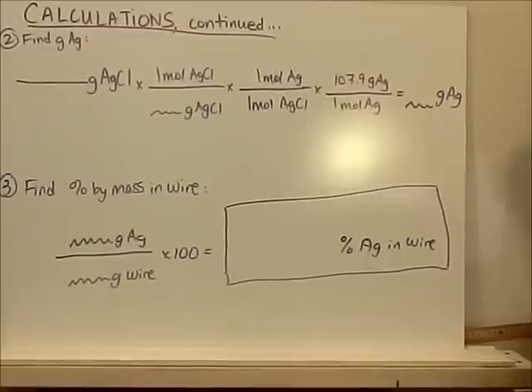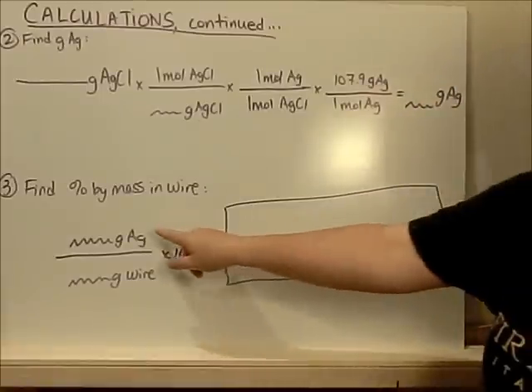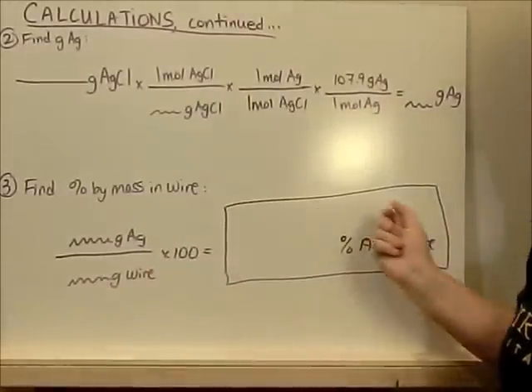You've done almost everything now. And just like I showed at the very beginning of this, you take this grams of silver, divide it by your grams of wire, times 100, and there's your answer.